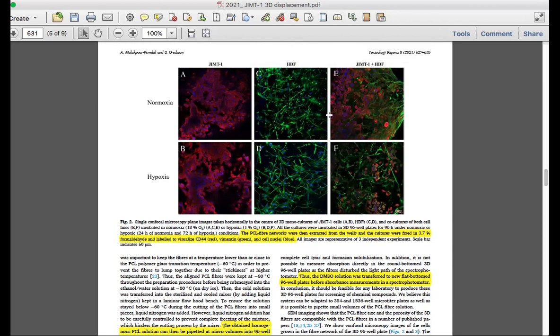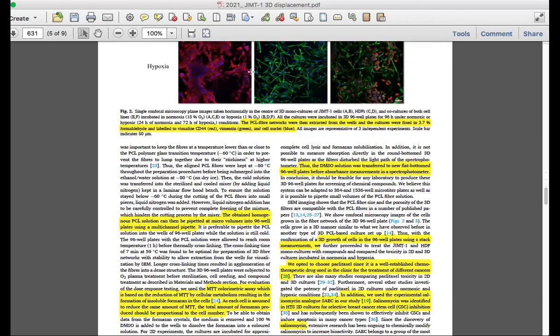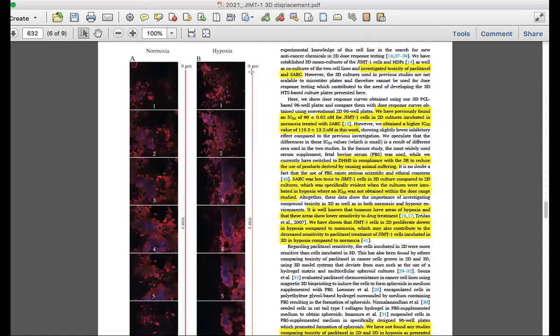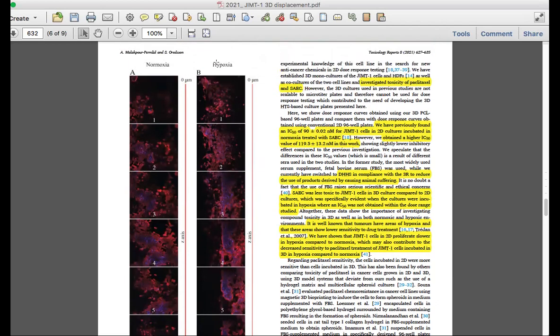And they also cultured these 2 cell lines. So here you see the picture of the co-culture, and the nuclei are stained in blue with DAPI. So what they did was also to use the confocal to obtain images of the z axis. And here you see 7 pictures in the 2 conditions, in normoxia and hypoxia.